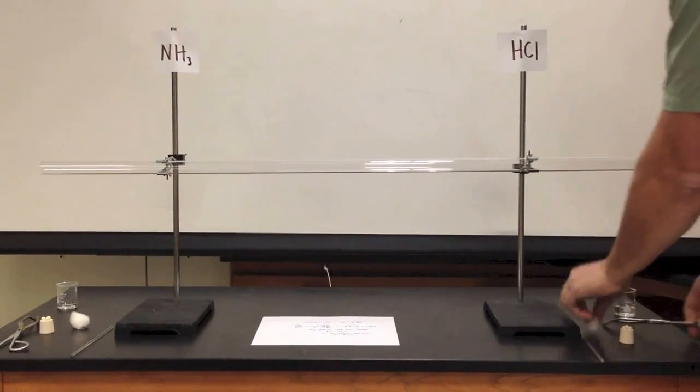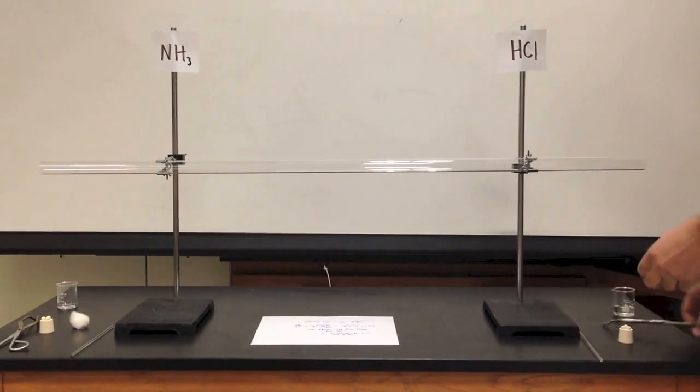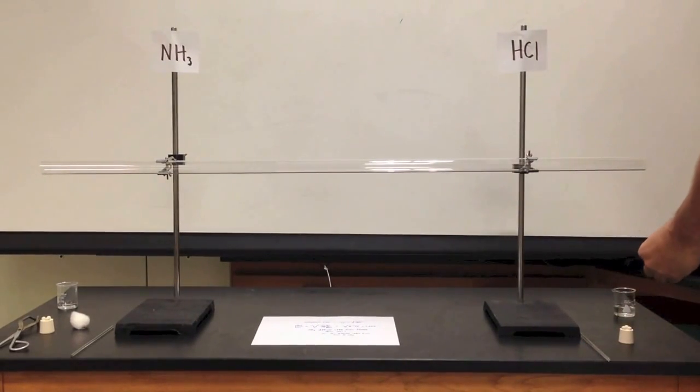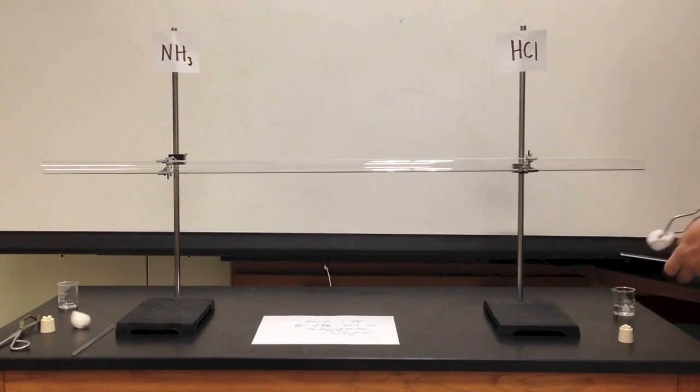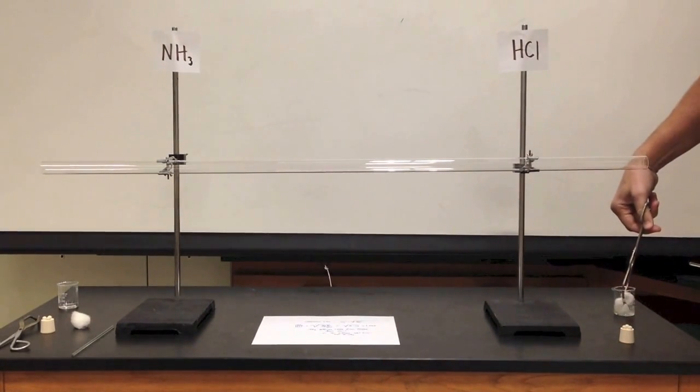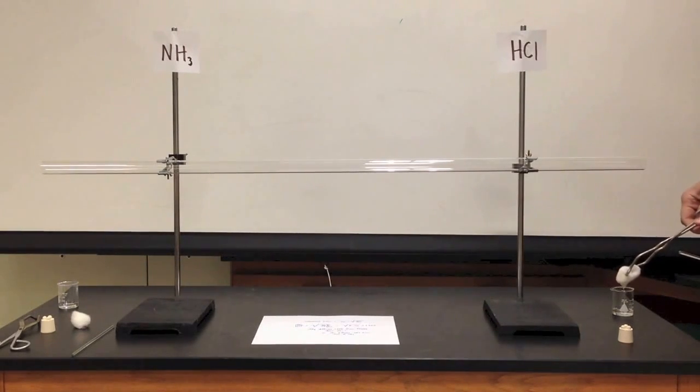Real quickly, I am going to add some hydrochloric acid to my cotton. I'm going to add it to this tube, so I'm going to dip some hydrochloric acid here. And I've got concentrated here today, as opposed to yesterday.